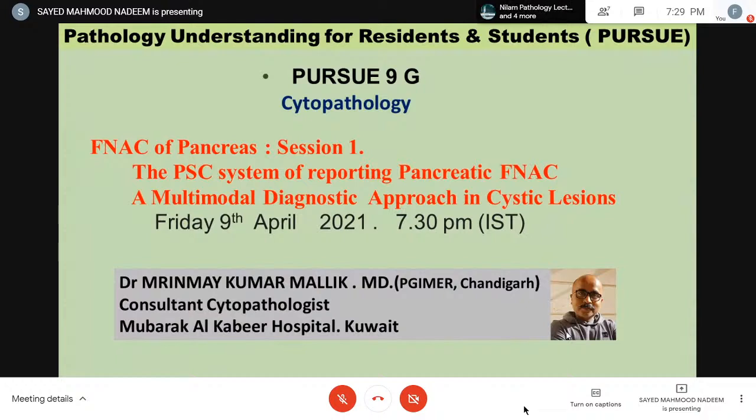And in this Session 1, the subtopic is the PSC system of reporting pancreatic FNAC. So this is something very important, very new, and we all need to understand that. And also we have the multimodal diagnostic approach in cystic lesions of pancreas. As we all understand, pancreatic lesions have to have a multimodal diagnostic approach to exactly come to a conclusion.